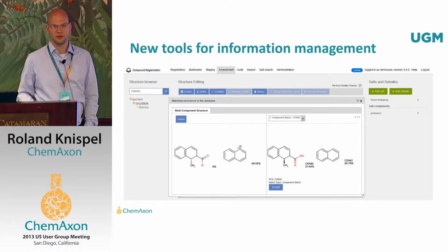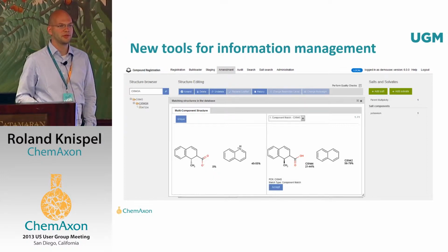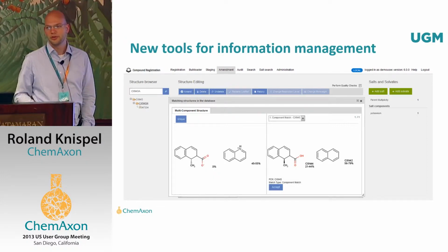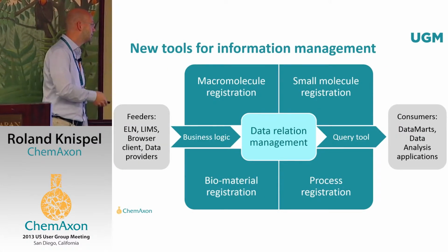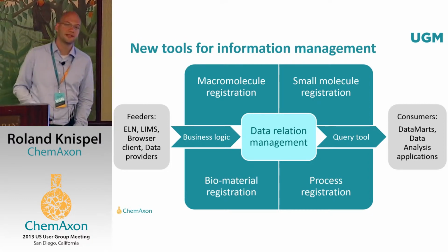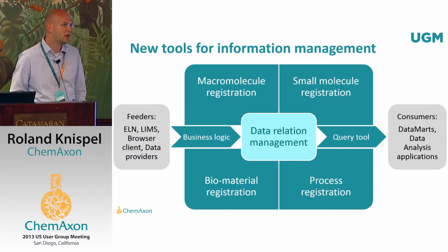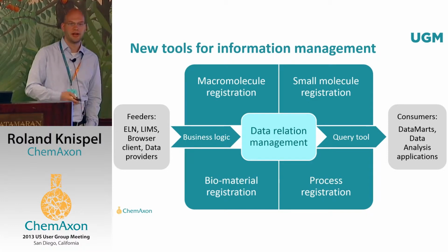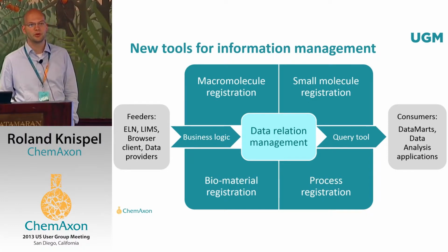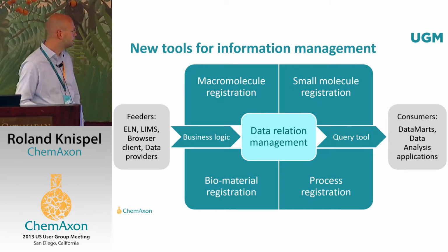However, that's just display and visualization. What we really need in the backend is an improved data and information management system which is able to cope with these large molecules. And I would like to elaborate a little bit on how we see such a data information management system, which at its core is largely a registration system comprised of a variety of modules dealing with individual parts of a typical workflow of a biotherapeutical development.